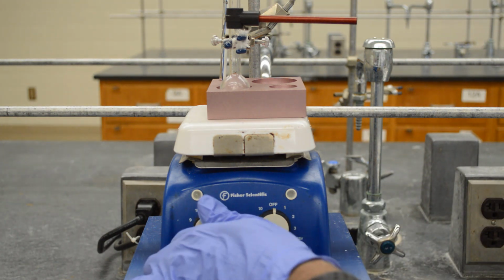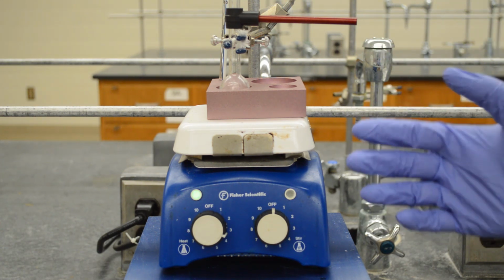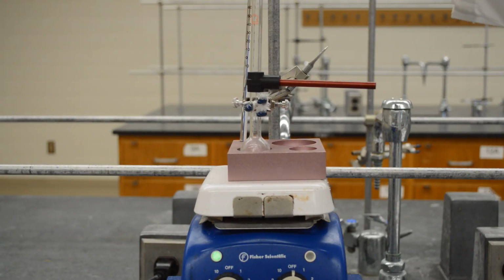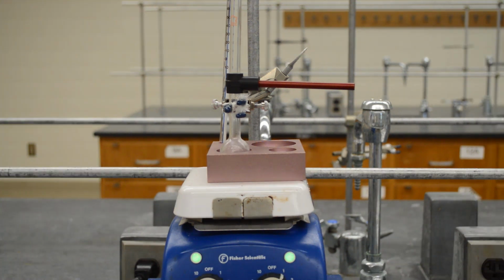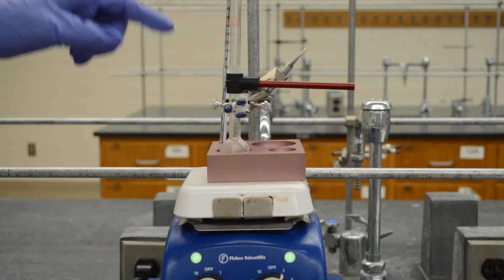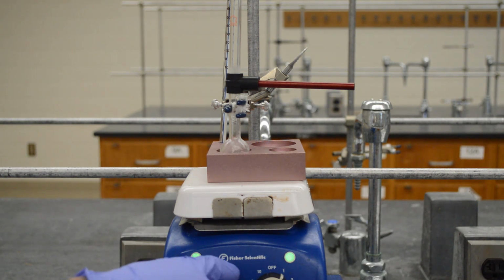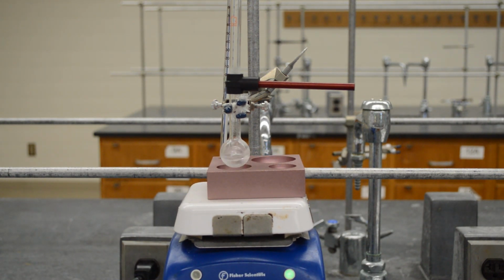Turn on heating. The reaction doesn't need a lot of heating, so you don't need to time the reaction, but just let it go for a brief boiling. Add a stir bar and start spinning. The reaction mixture started boiling at about 130 degrees centigrade. So I'm going to remove the heating and let it spin at room temperature for another 15 minutes. So turn off the heating, lower the hot plate, and let it spin for another 15 minutes.